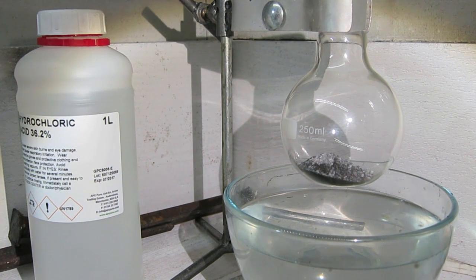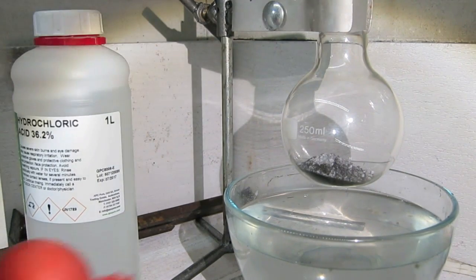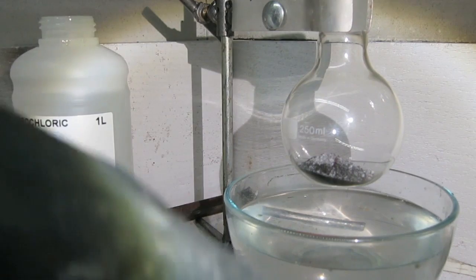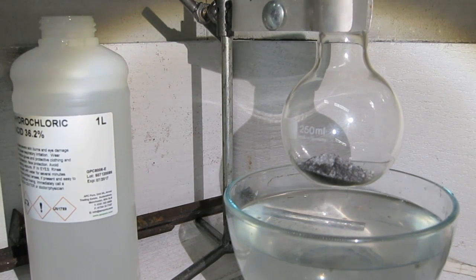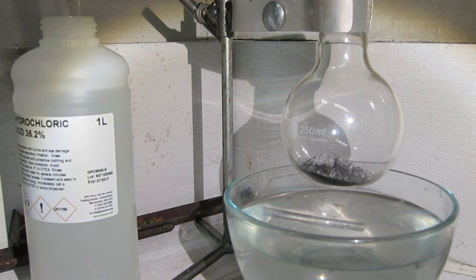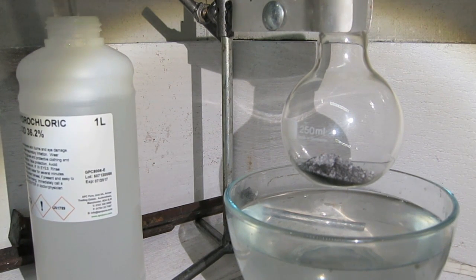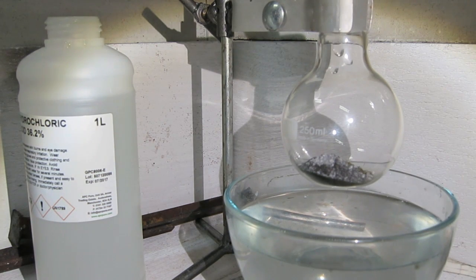And I fill this. Okay, so now I'm going to add the hydrochloric acid to the mixture. Okay, that's it. 24 milliliters of concentrated acid added to the mixture.